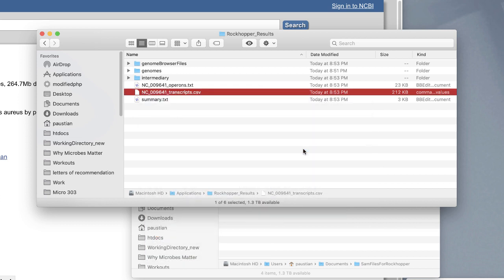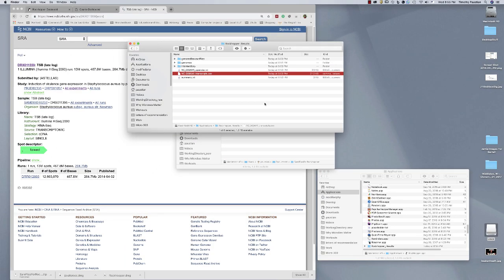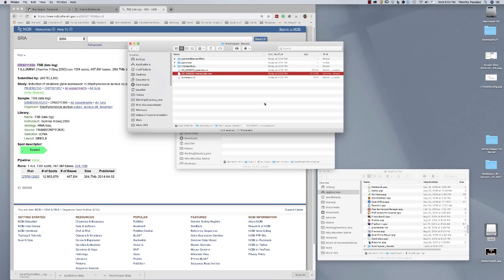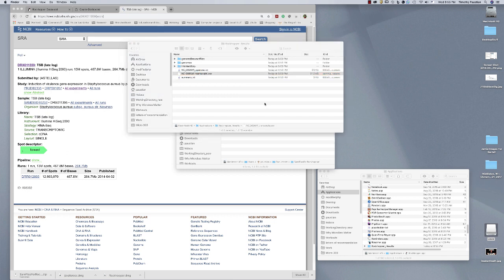We then click on this and we are going to open this with Microsoft Excel. This then launches. Realize what we just did: we took all this sequencing data, we mapped it to a chromosome, and we know what the expression of every gene within that organism was. That's pretty cool.